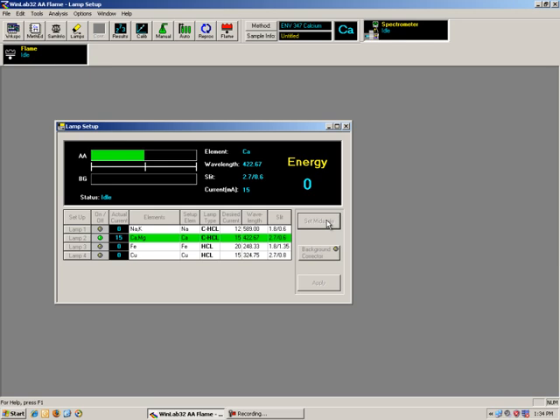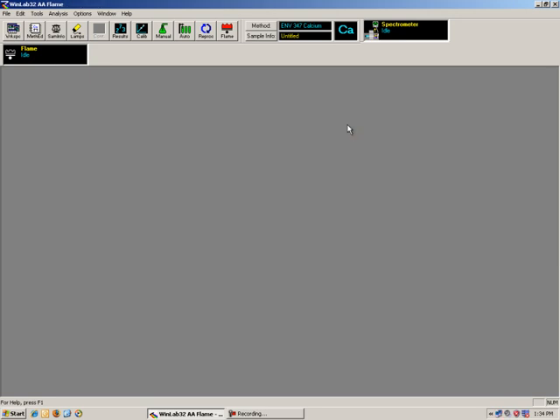Again, if that were below 50, I would start to worry about if my lamp was getting too old. And typically what happens is lamps will lose their high vacuum inside through very, very slow leakage through time. They usually last for many years. So with that, we can X out of the lamp setting. And then the next thing we'll do is to go to continuous right here.